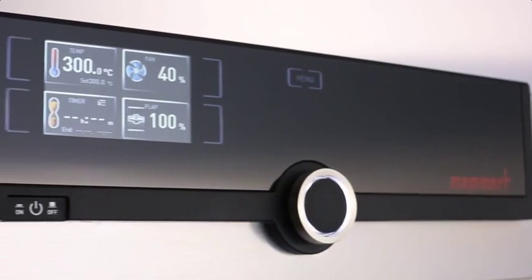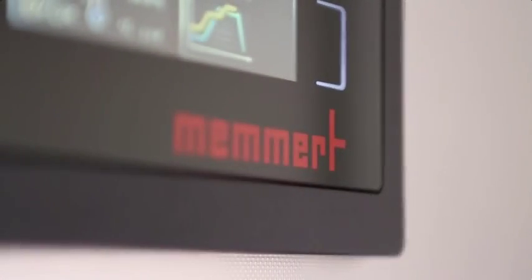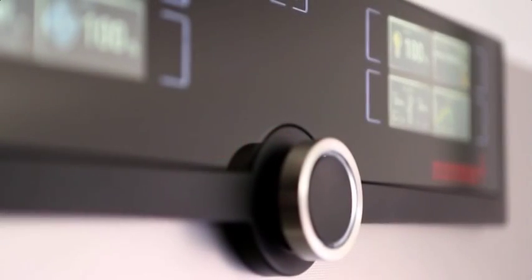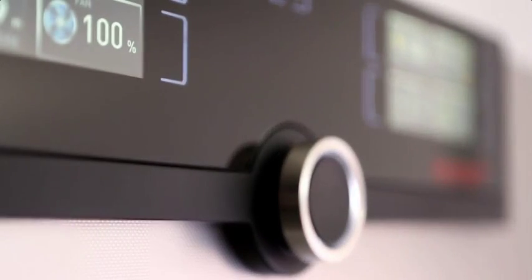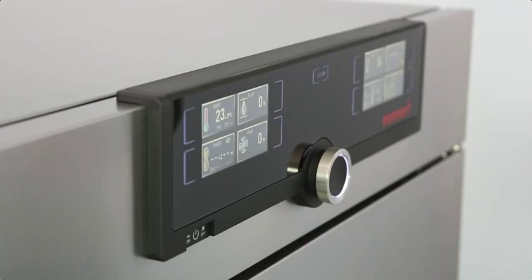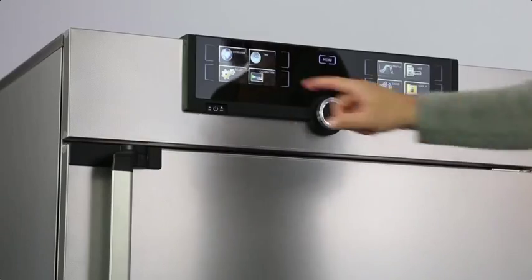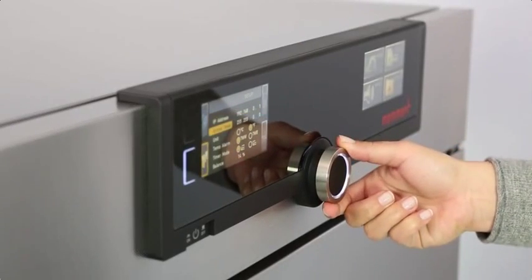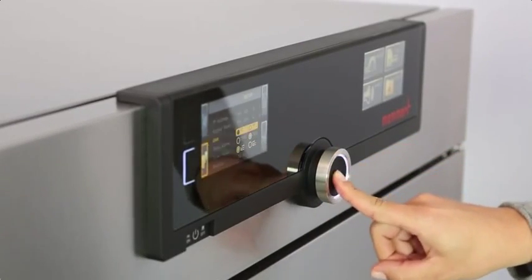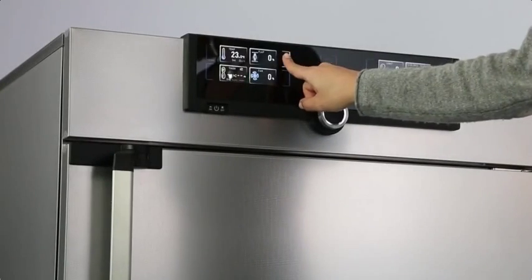Intuitive operation — fast, everything in view. The control cockpit of the new Generation 2012 appliances gives you time for the things that really matter. Three quick steps and every function is ready. You prefer Fahrenheit or Celsius? There you go. Touch, turn, and go — was it ever easier to operate a heating oven?